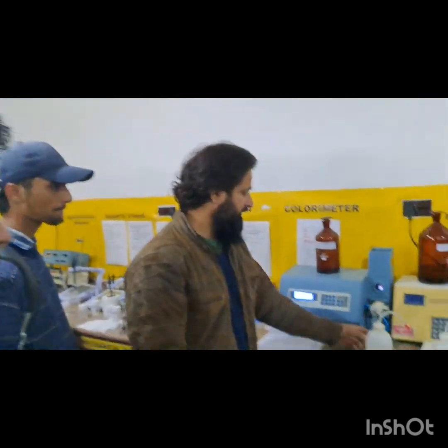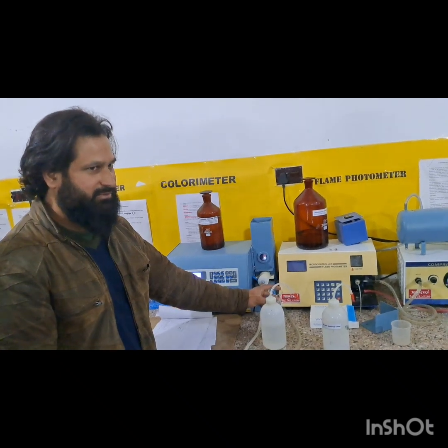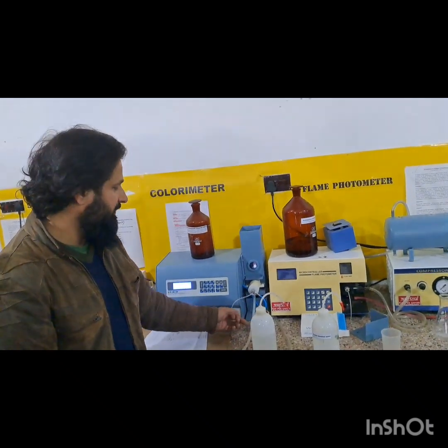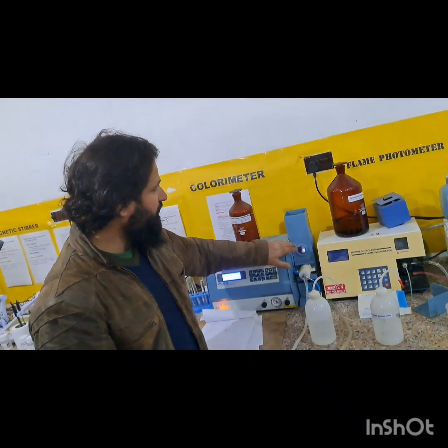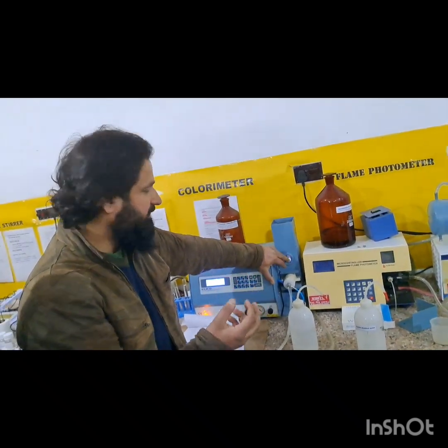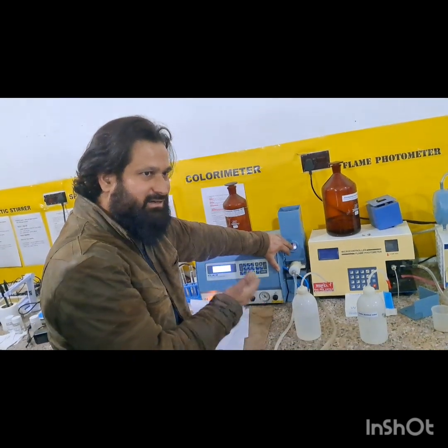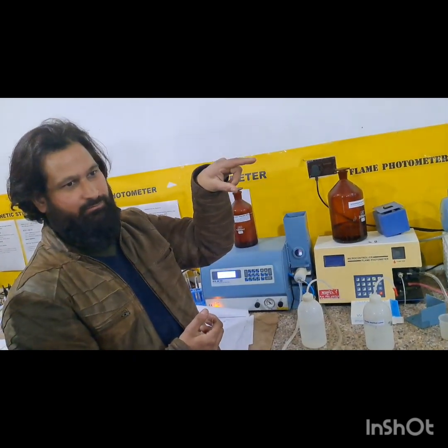6. Learning outcomes. By the end of the visit, students gained a foundational understanding of soil testing and its role in agriculture, knowledge of different techniques and tools used in soil analysis, awareness of the importance of soil conservation and sustainable farming practices, insight into career opportunities within the field of soil science and agronomy.